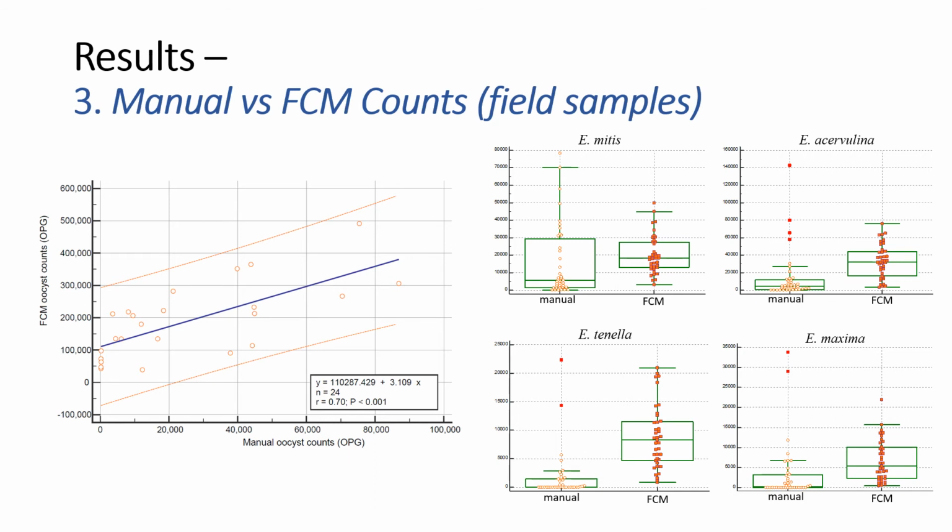As with the vaccine, fecal samples were tested by flotation and flow cytometry. Beads were used for flow cytometry to calculate the numbers of oocysts per gram. No interference with Eimeria populations was observed with the use of counting beads. There was a weak correlation between both methods, but all the values fell within the 95% prediction limits, as shown on the graph on the left.